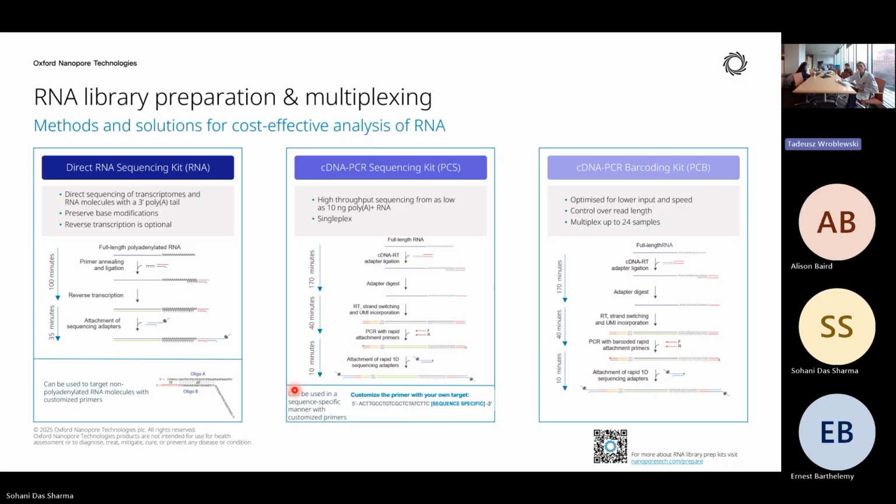They don't have a good library making kit for microRNA, but they did recommend a different company, I think it was Qiagen. Even if I have a cDNA library for these microRNA, can I run them on this? I need to know exactly what the sequences are and whether it would be compatible or not.